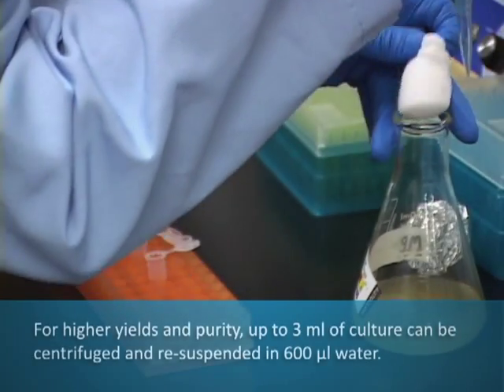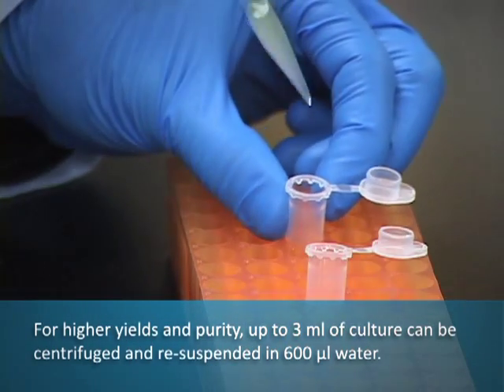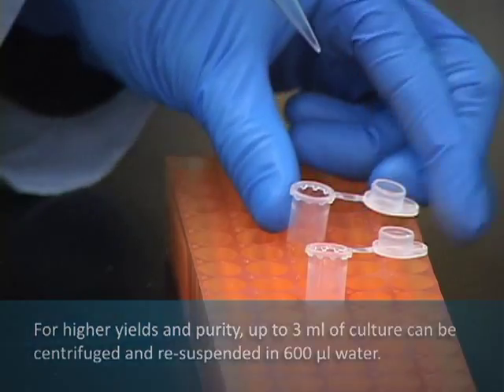For higher DNA yields, up to 3 mL of culture can be centrifuged, and the pellet resuspended in 600 microliters of water or TE buffer.